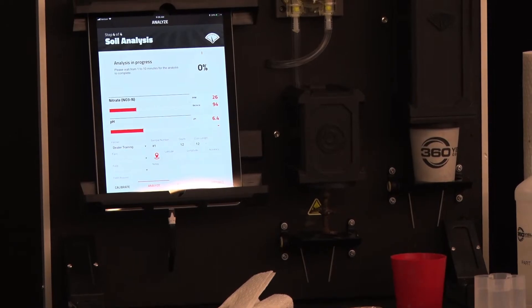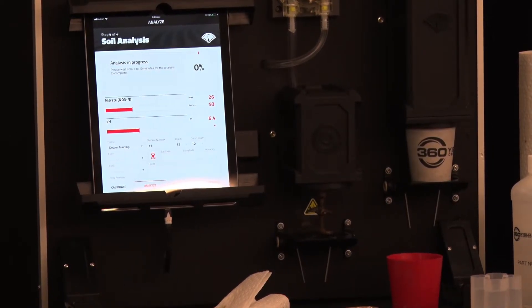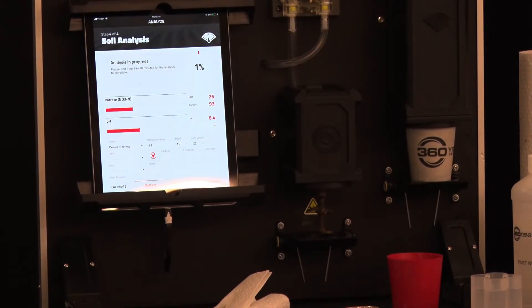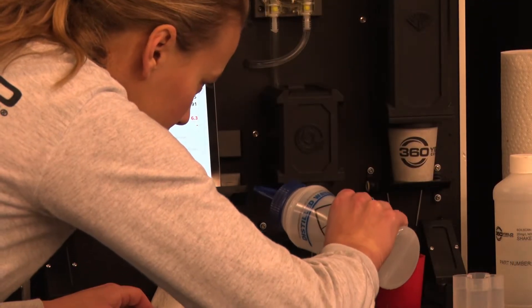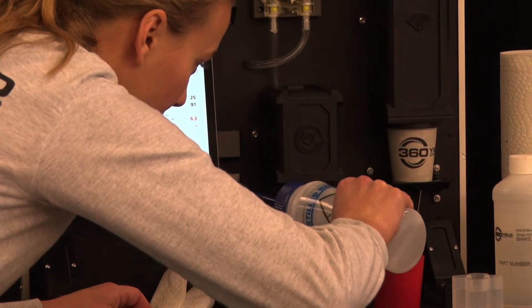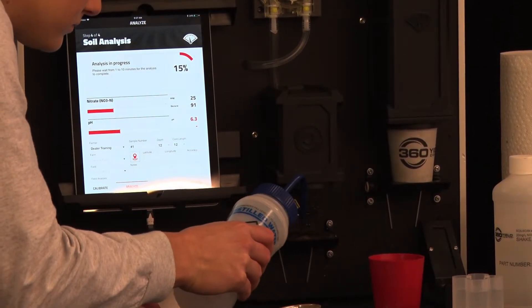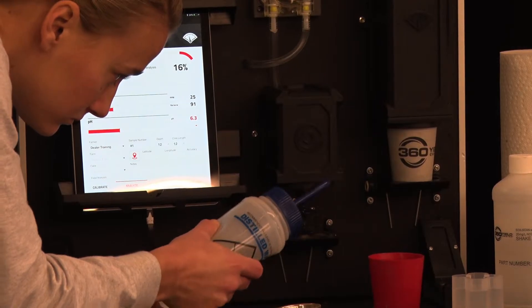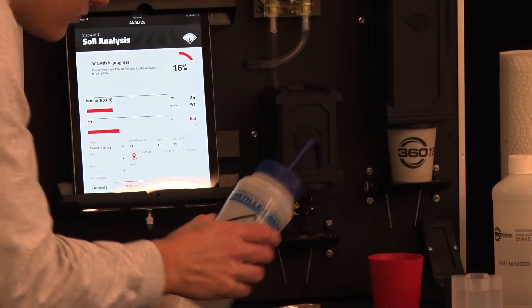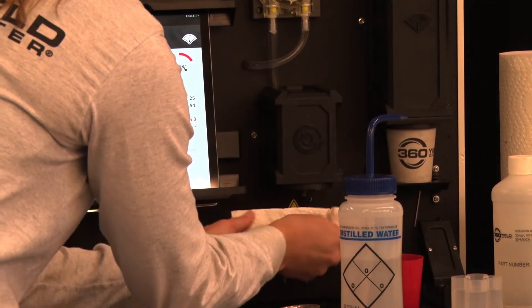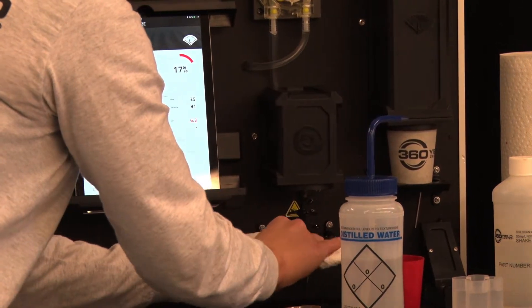The sensors will continue reading the slurry until they get 10 of the same reading and then it will be done. While it is reading that slurry if you're going to be doing another sample you'll want to clean your mixing rod. It is important to clean the mixing rod and the sensors between every sample. Use distilled water when cleaning.